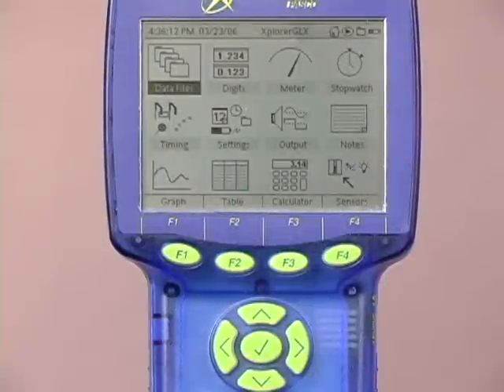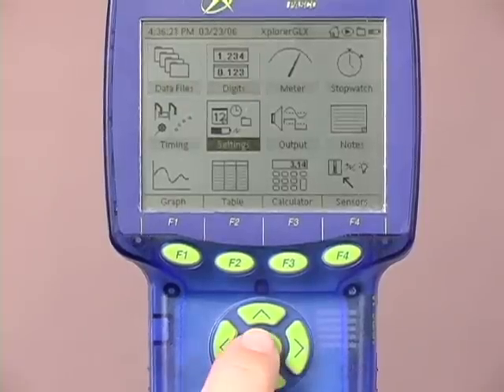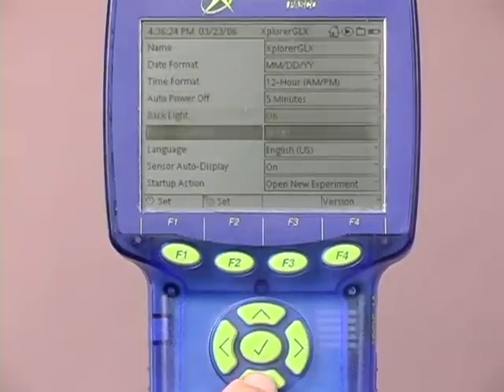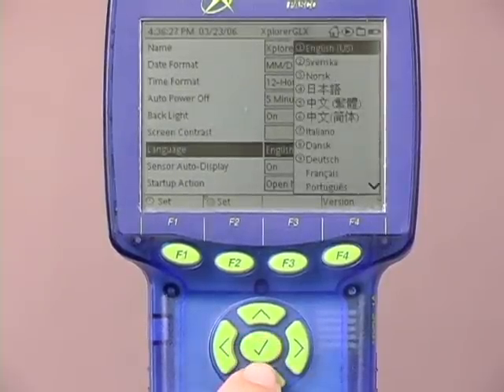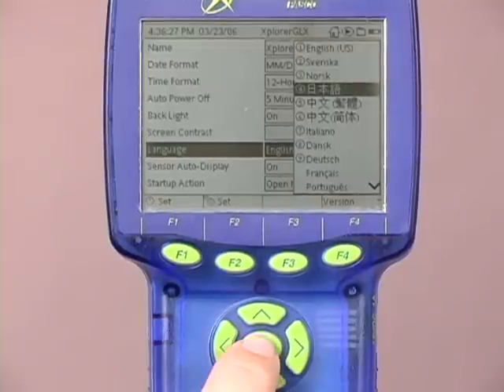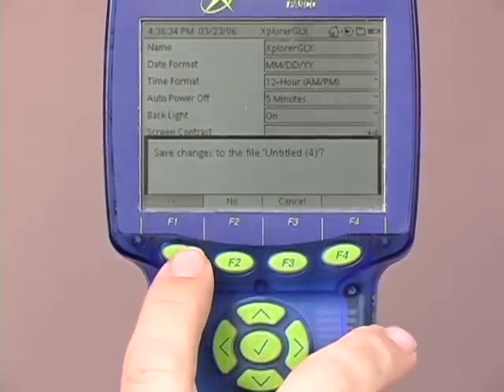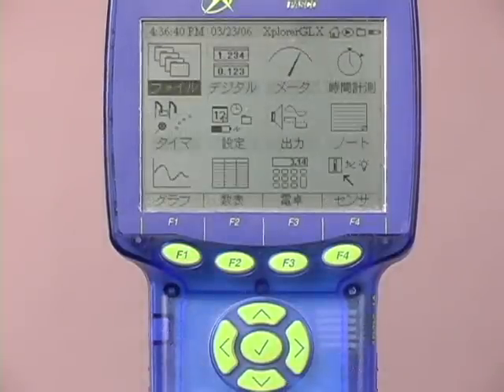If you would like to use a language other than English with your Explorer GLX, please follow these steps. Use the navigation keys to move to settings and select settings. Move down the menu to language and select language. From the list that appears, select the language that you are interested in using. Check for OK and confirm. Within a few seconds, you'll be ready to go.